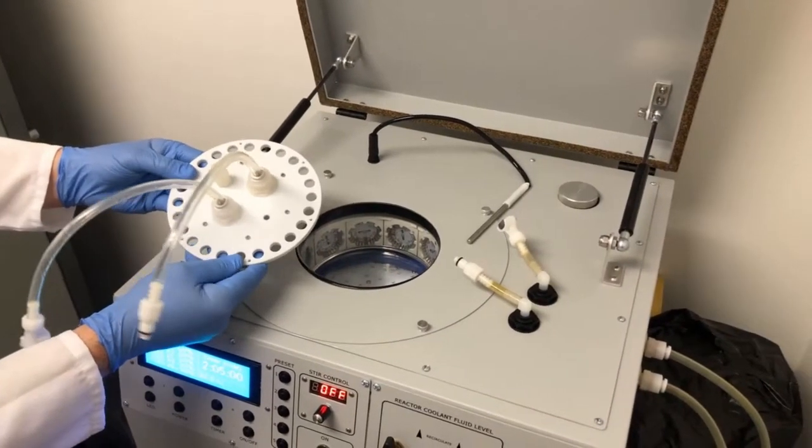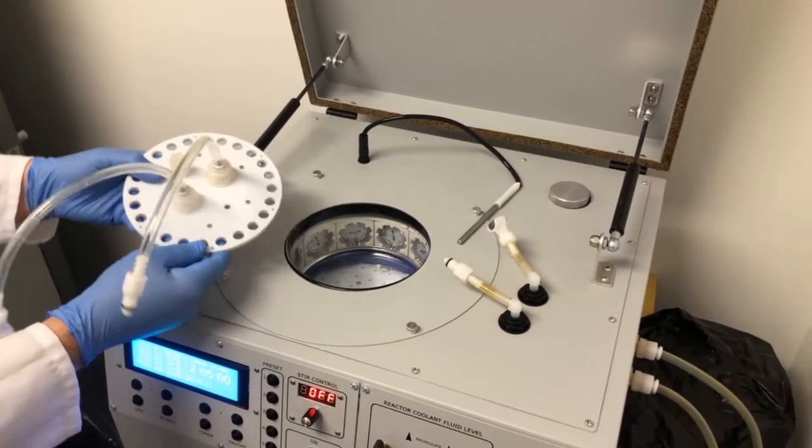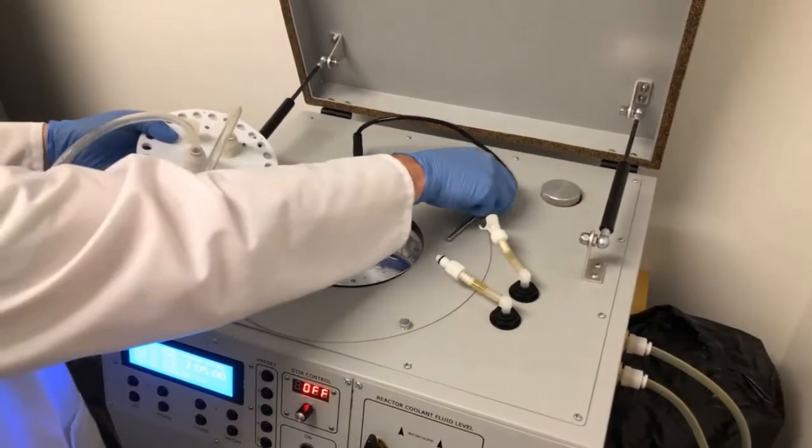For this example, we're using our 2 milliliter vial reaction vessel, which is a typical setup for parallel photochemistry.